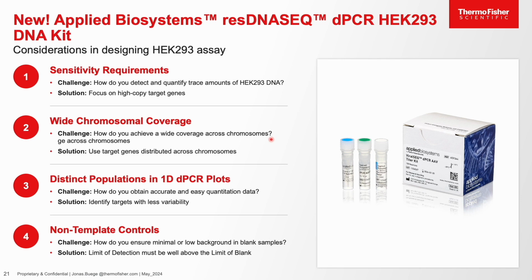Thirdly, we need to identify targets which have less variability for accurate quantitation, so as to ensure that there are distinct populations between the positive and the negative population in the digital PCR plots. Lastly, for the non-template controls, we also have to ensure that there's minimal background in the blank samples with a limit of detection that is well above the limit of blank.